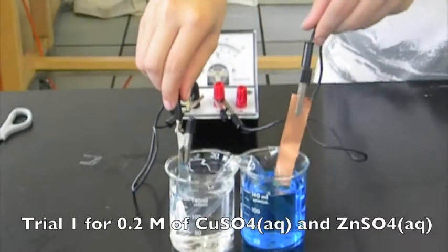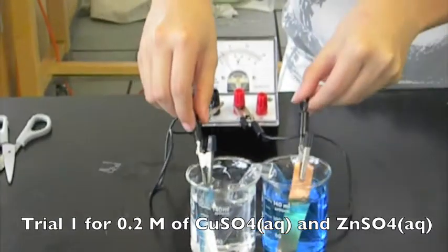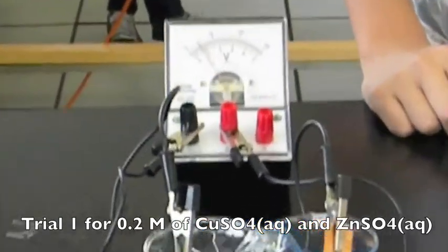Here's the first trial of the galvanic cell that used 0.2 molarity of copper sulfate and 0.2 molarity of zinc sulfate.